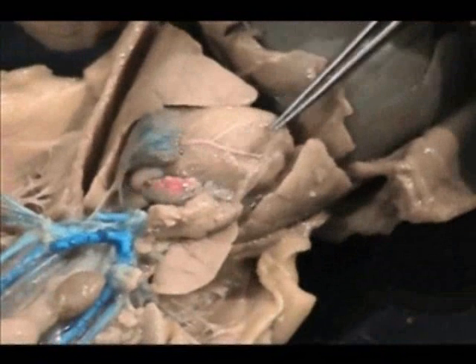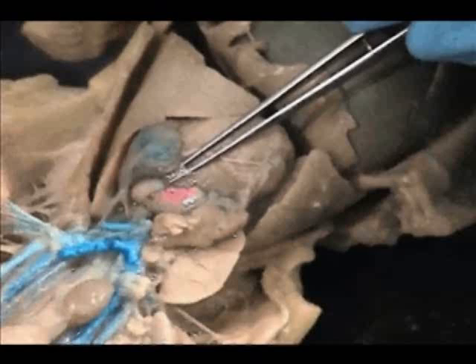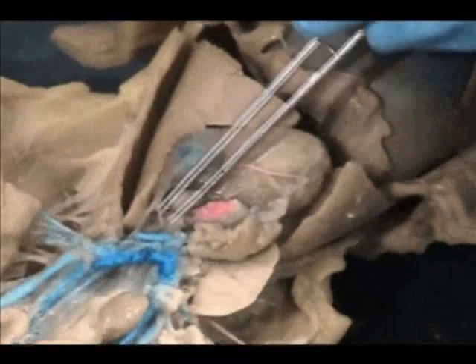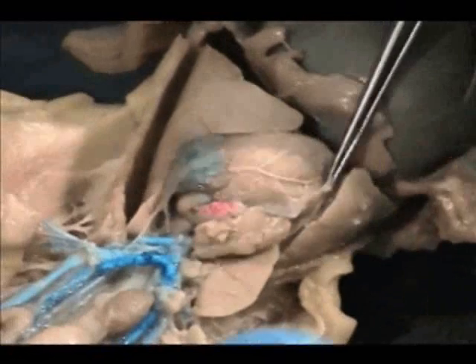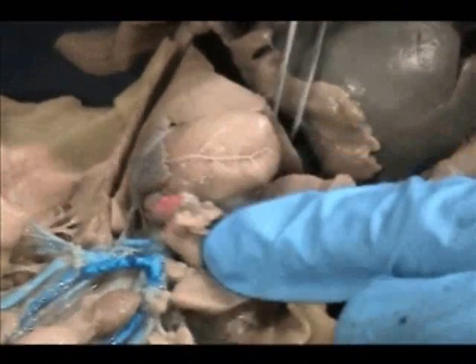I've cut the pericardial sac on the ventral surface of the heart, including the thymus, which is laying with the pericardial sac on the ventral surface, all the way up to where the blue structures are located — very carefully, trying to avoid cutting the blue structures. Let's go ahead and push that pericardial sac out of the way.